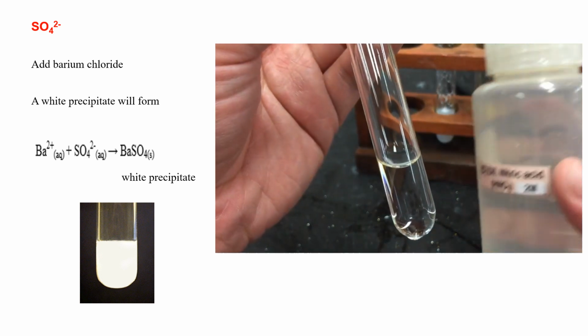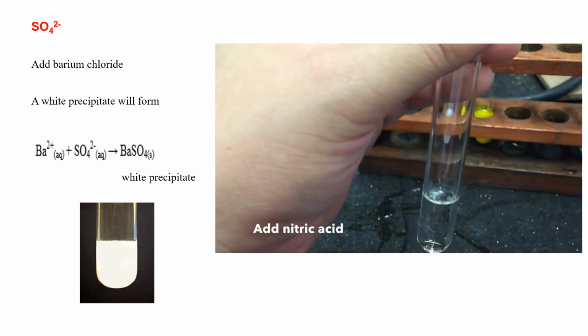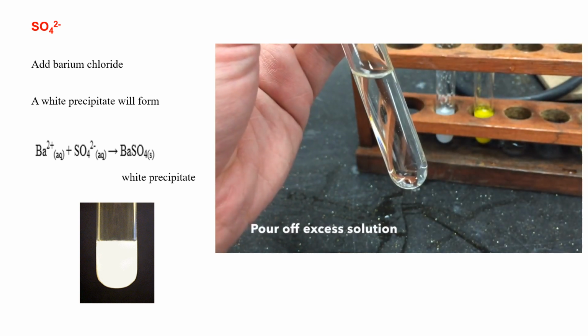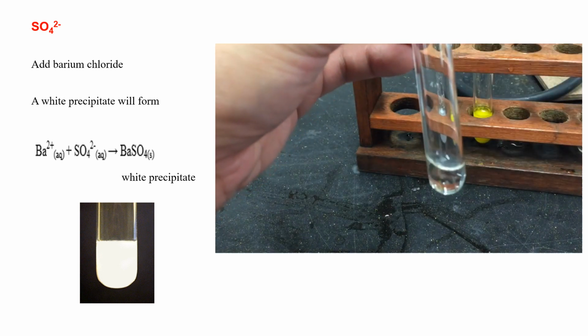For a small volume of your solution, add an equal amount of dilute nitric acid. If you find yourself with excess solution, pour off the excess and leave only a small volume within your test tube.